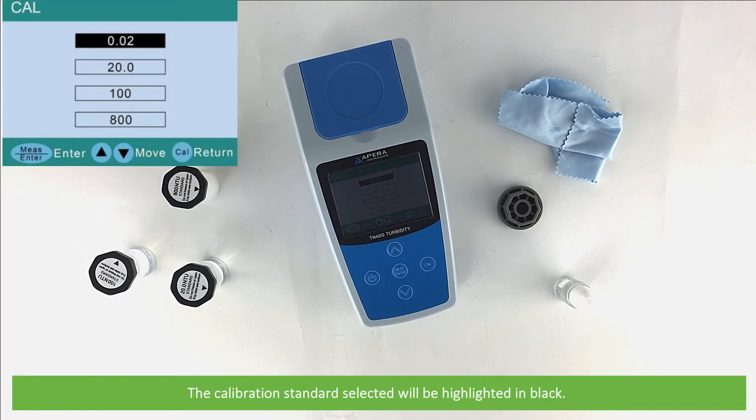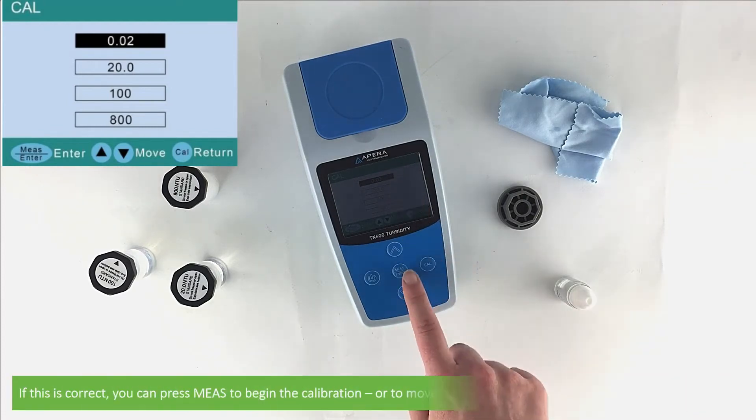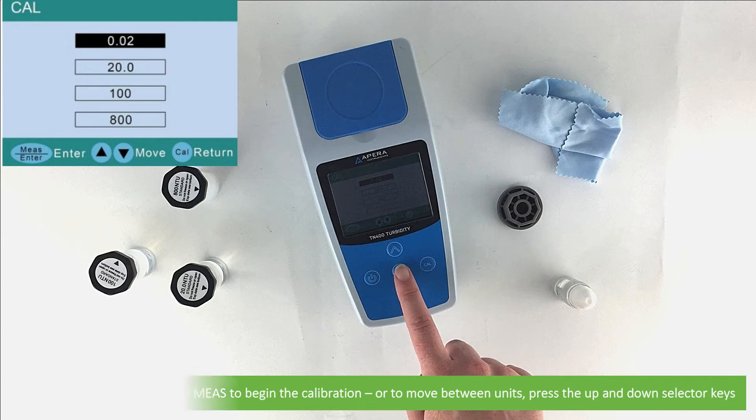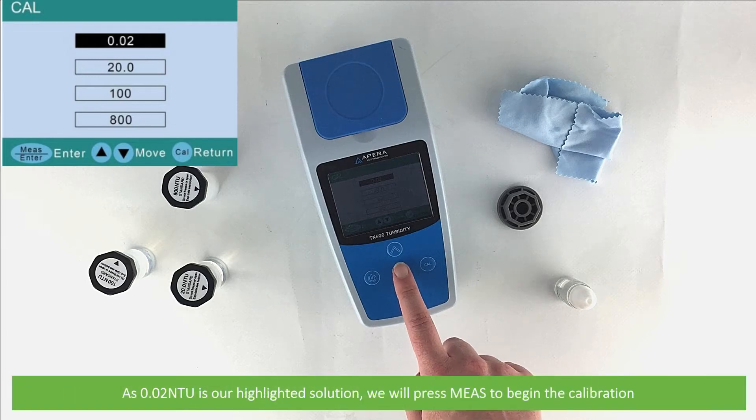Press the cal key. The calibration standard selected will be highlighted in black. If this is correct, you can press measure to begin the calibration, or to move between units press the up and down selector keys. As 0.02 is our highlighted solution, we will press measure to begin the calibration.